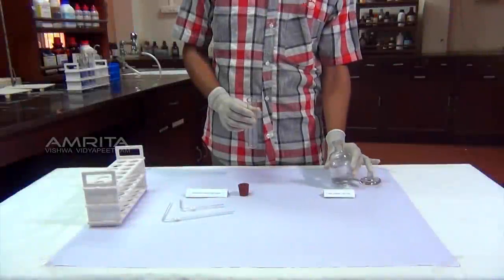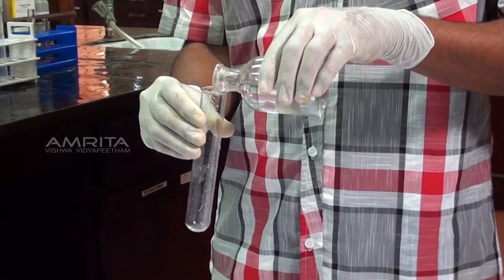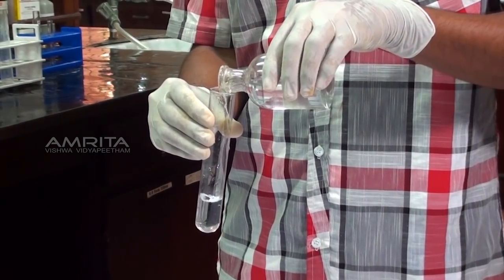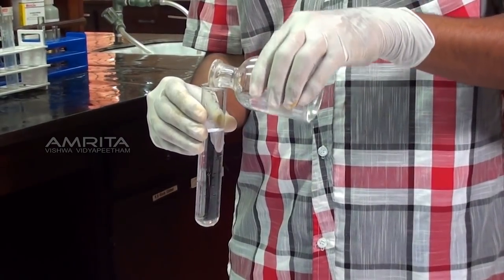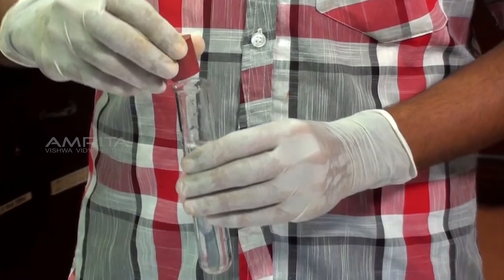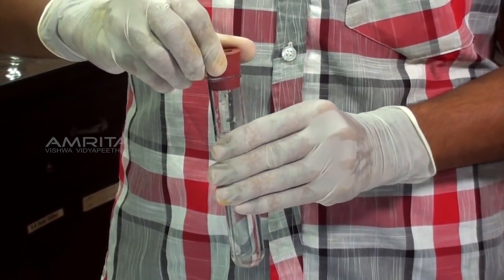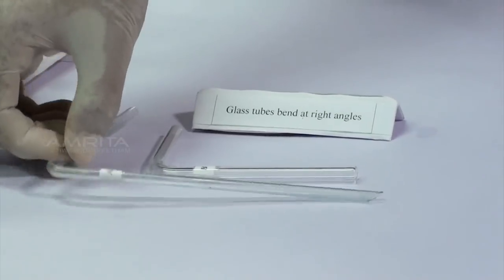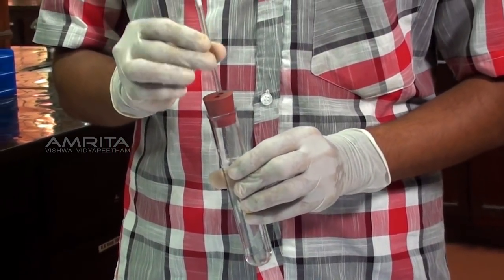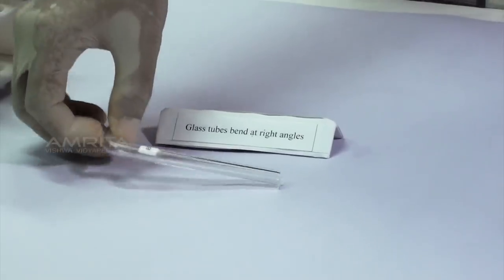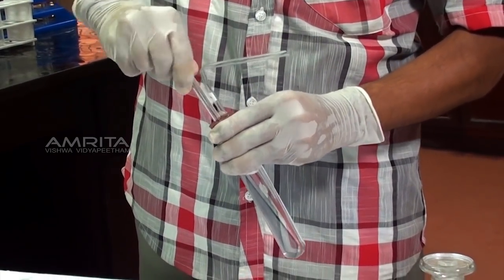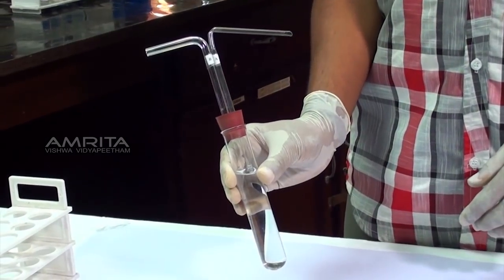Procedure: Pour freshly prepared lime water into the boiling tube so that it is three-fourth full. Take a cork with two holes and fix it into the mouth of the boiling tube. Insert the glass tubes, let us name them A and B, into the boiling tube through the cork so that the end of glass tube A dips in the lime water.